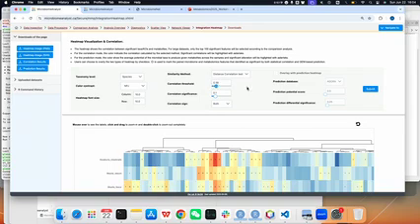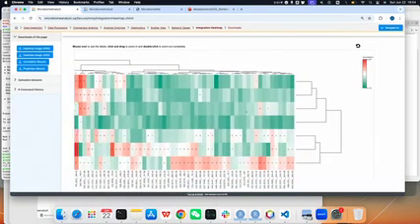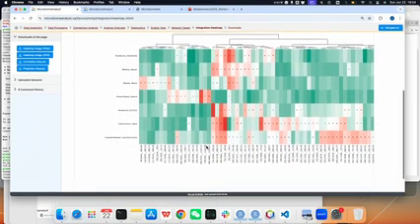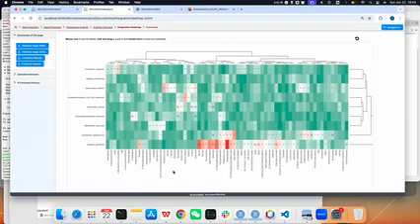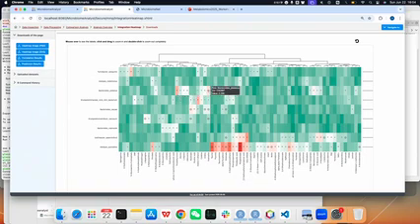You can depend on your needs. But this is a pity for the peaks, because we don't know what metabolites they are. But I will show another example here. We have the metabolites, and then if you know them, you have the microbe. You can overlay the two layers. First is the correlation, like the peaks, where we get a statistical correlation. Then we have the GEM model to get the prediction.